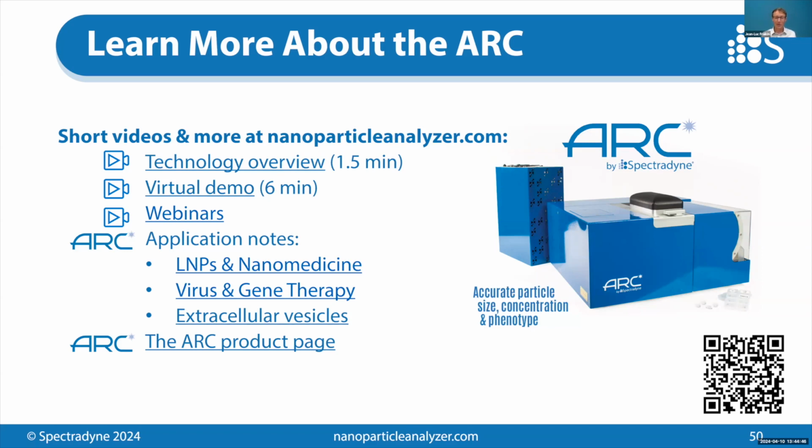Last question on the LNP. Thanks for all these good questions. How stable are LNPs during measurements with the ARC? Why are all the LNP measurements presented as a power law distribution with no apparent peaks? Is that always the case when LNP size is measured with the ARC? So it's not the case. Some formulations do show peaks when measured by our electrical technique, the MRPS technique. It depends on how they're produced in our experience. Some formulations are made by different methods and yield different size distributions. That's why it's important to be quantifying them.